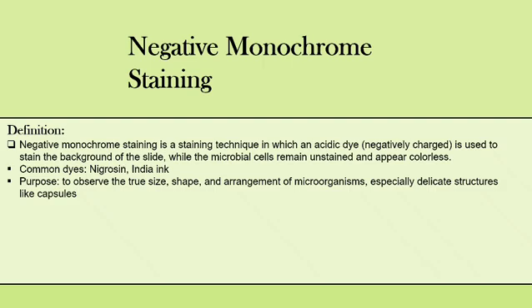The purpose of this is to observe the true size, shape, and arrangement of microorganisms, especially delicate structures like capsules. We observe special structures like capsules from this staining method.